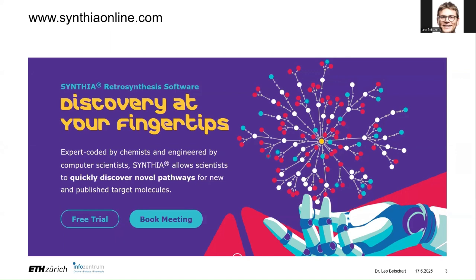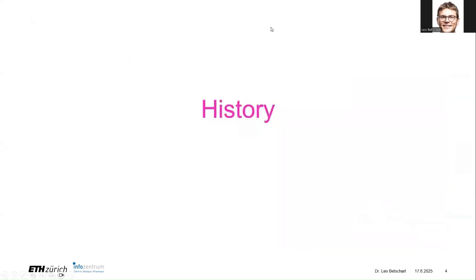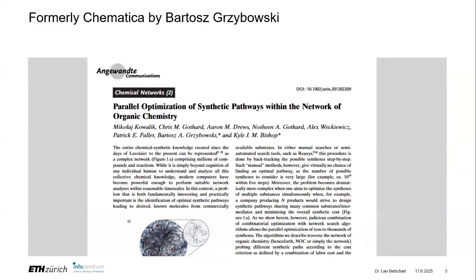But now let's quickly have a look at the history of Synthia. Coming back to the title page with the spider web, how did this come about? There is quite a bit of research behind this, and this started in the research group of Bartosz Grzybowski, which was at Northwestern University, and then moved to South Korea, and did a lot about networks of compounds and reaction networks.